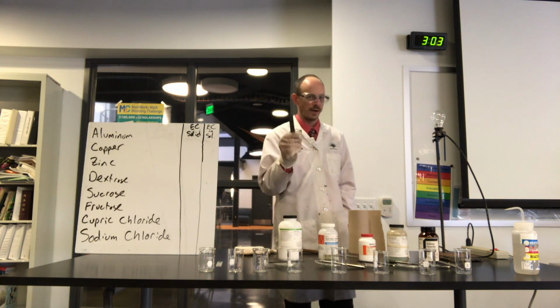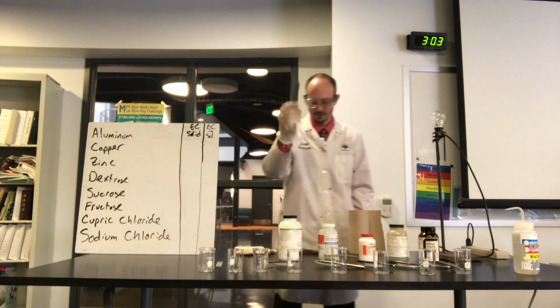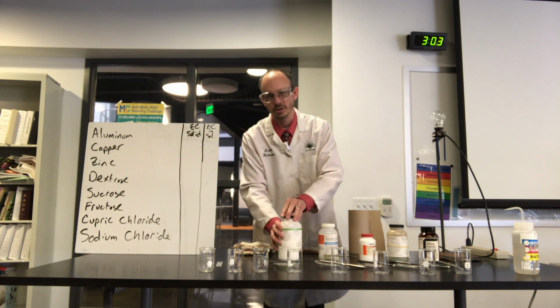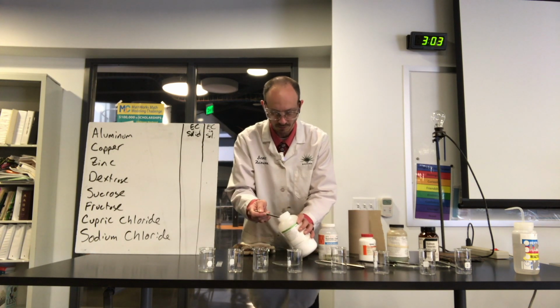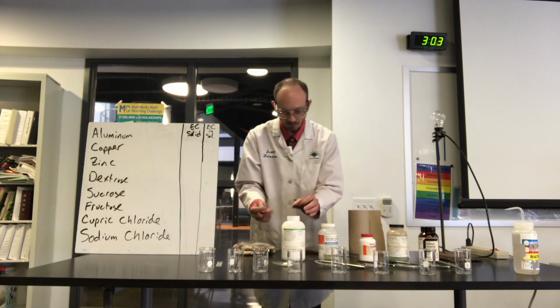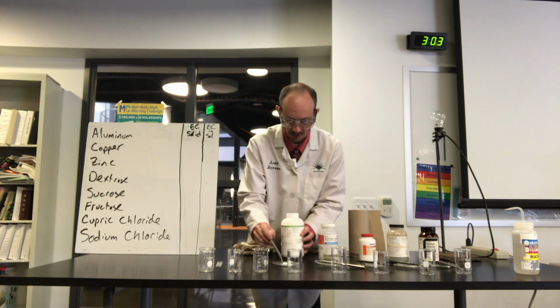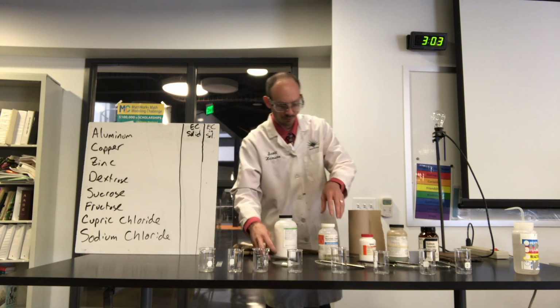I think you might have found a pattern right now. Yes, yes it does. Now, what I'm going to do next is just put a little bit of these solids here. And the thing about electrical conductive solids is if there is a pathway, they will conduct. So, you know, this is what we've been talking about with electron transfer. As long as there is a pathway, we will see a spot or an area where the electrons can transfer, and then we'll be all good.